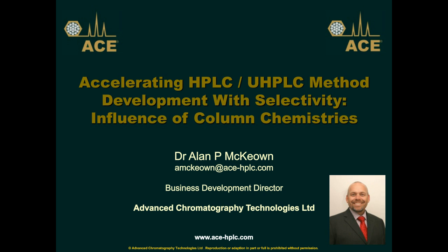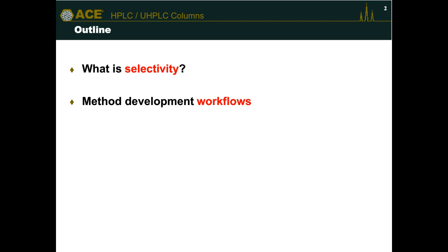So first of all, I'll begin this talk by talking a little bit about, very briefly, what I mean by selectivity, just so that we are all familiar with the terms that I will use. Then I will begin to speak a little bit about method development. How do we do method development? What are the options and different approaches that people tend to use in their laboratories?